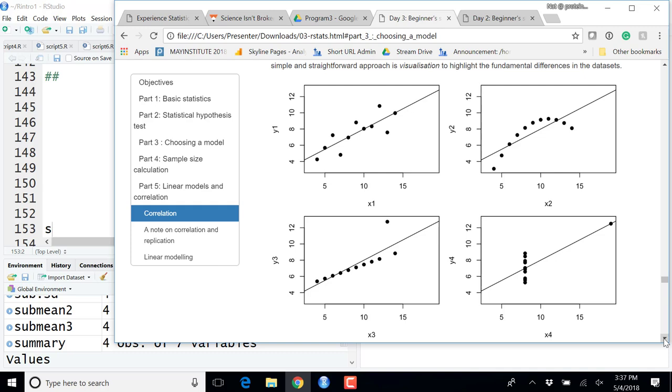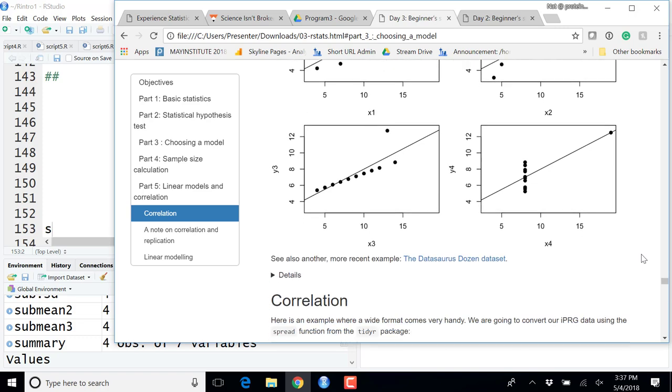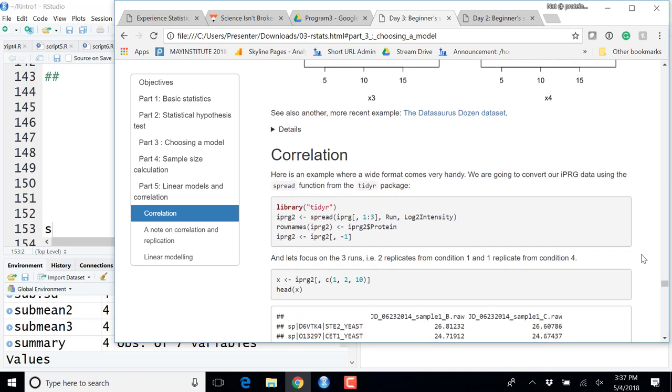Most likely, as I have gained more experience, I spend more and more time looking at the data first, then pre-processing and filtering and finding the issues, and then the rest can be more straightforward. So these are the cases. That is what I want to address first. But be careful. Now let's try to make a correlation plot.